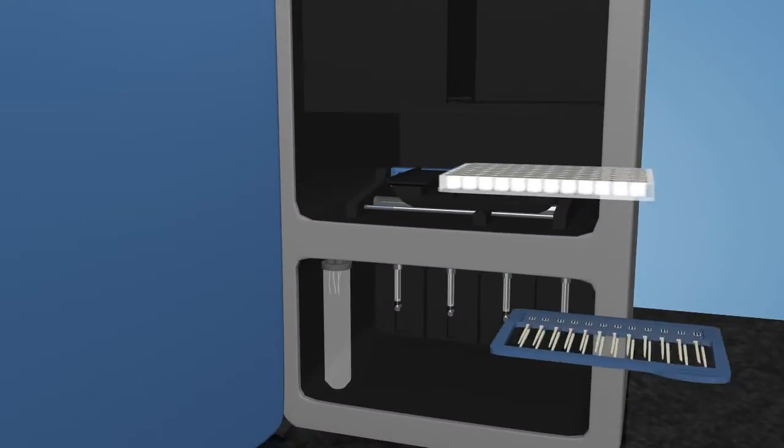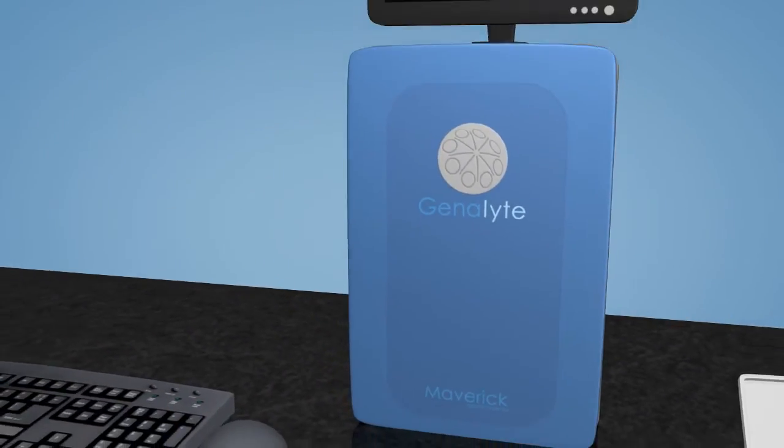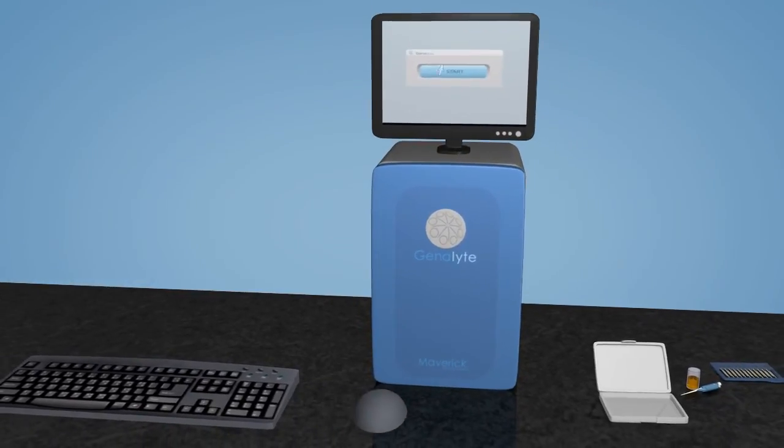Once loaded, the instrument software prompts the user to start the assay and from there the remainder of the workflow is automated.